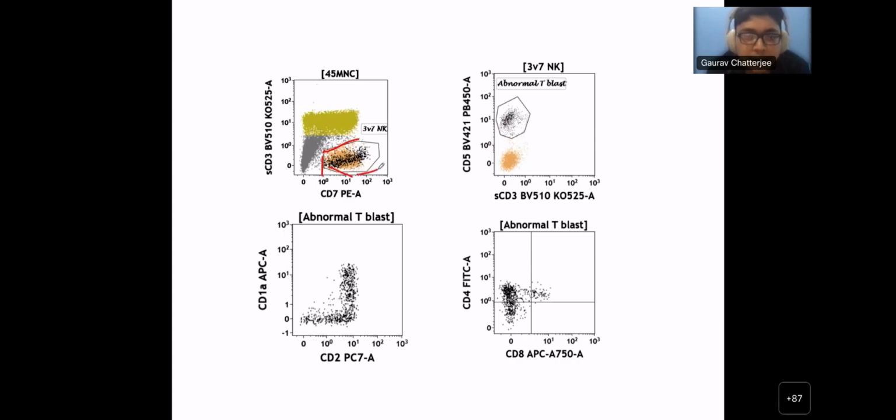So what normal cell can be here? Do you know? Can you tell me? Like what cells in the body are normally CD7 positive but surface CD3 negative? Anyone else? Precursor thymocyte cells. Okay, but would they come in peripheral blood in a huge number? No. Normally they should not be circulating in peripheral blood in such a good number. So any other normal cell that is CD7 positive other than T cell that you know?